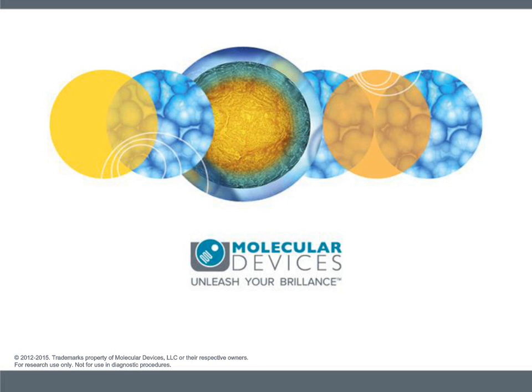Great, thank you. And Cathy, does the MiniMax automatically detect and count cells?